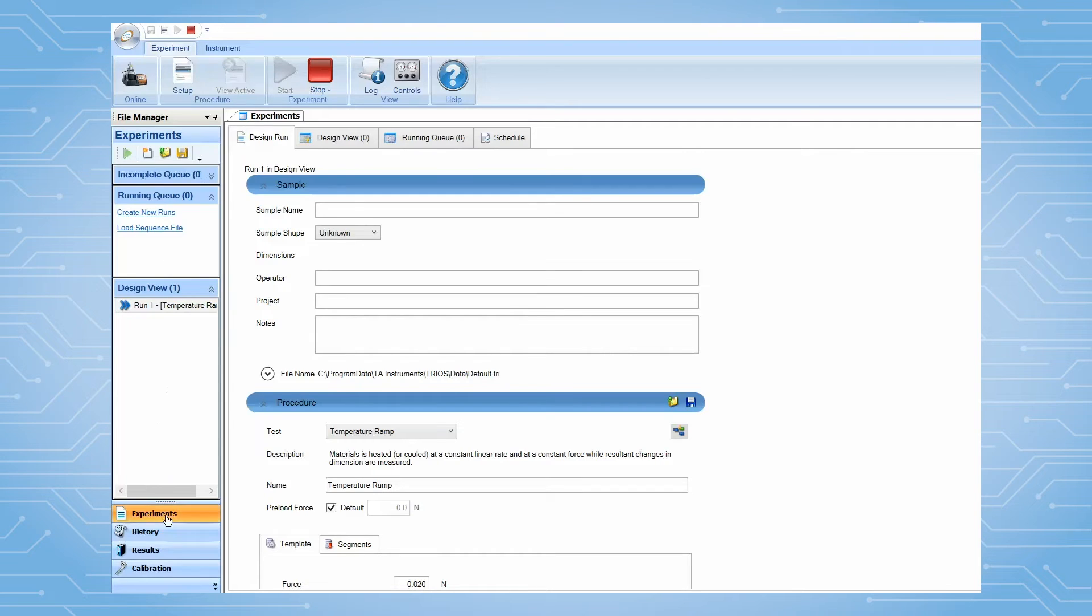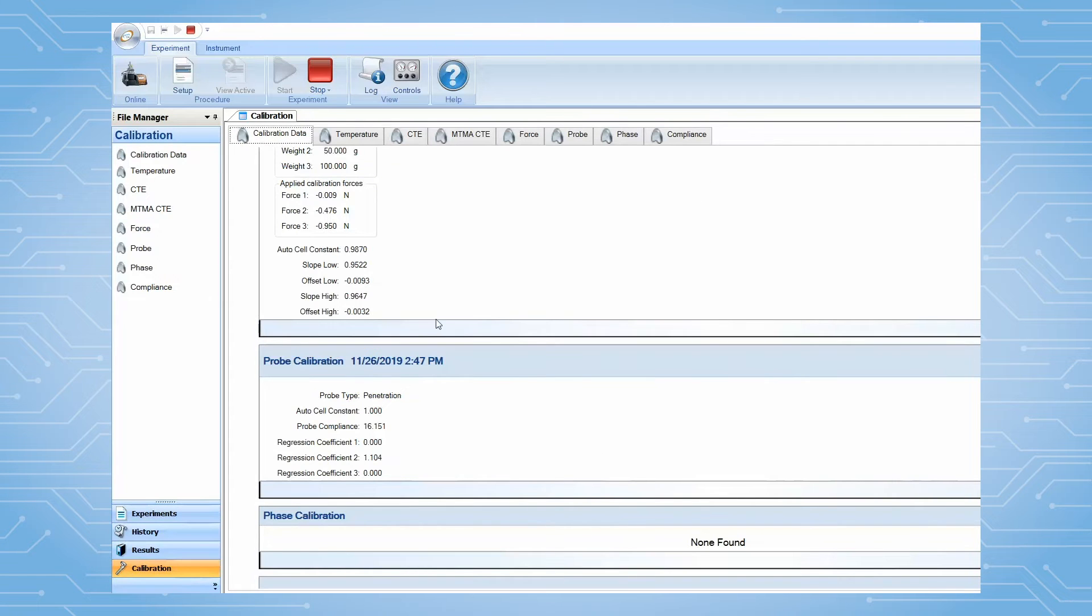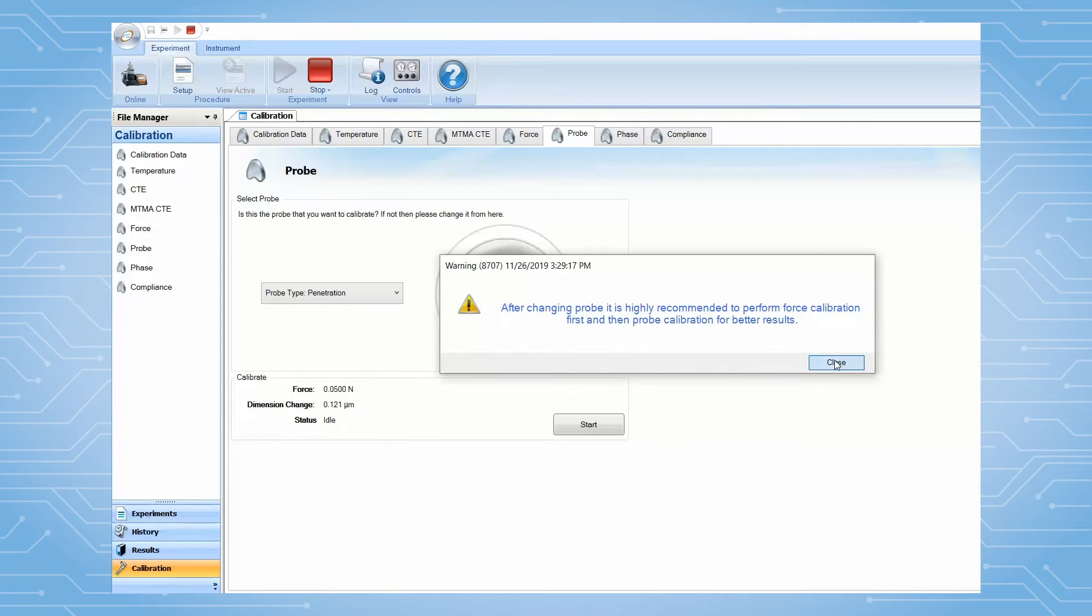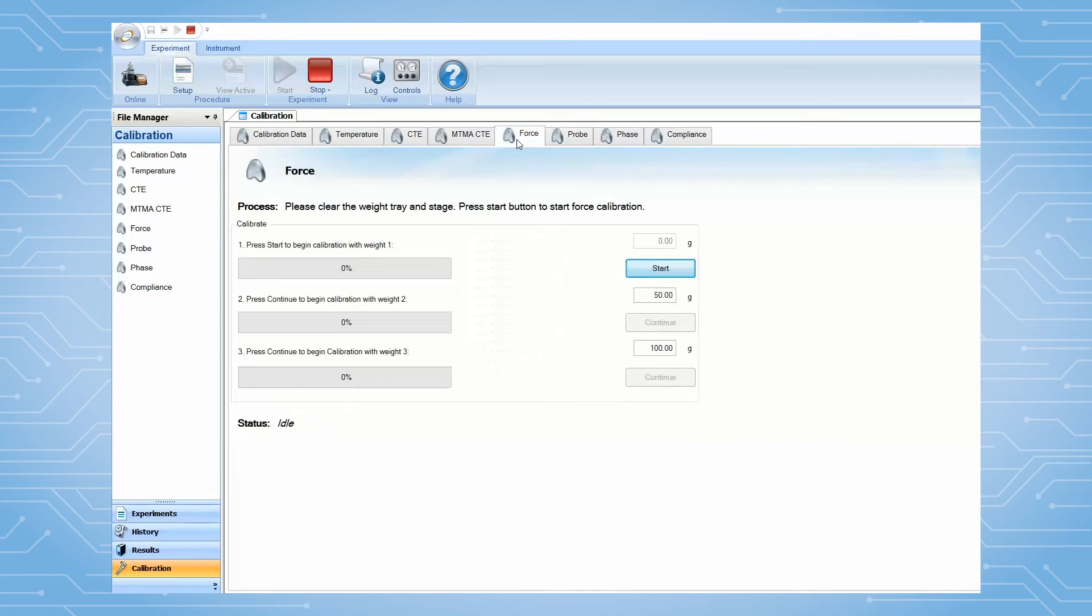Next, from the TRIO software, go to the file manager calibration panel. Click on the probe tab. Select the type of probe you will use. Go to the force tab and click start to begin the calibration.